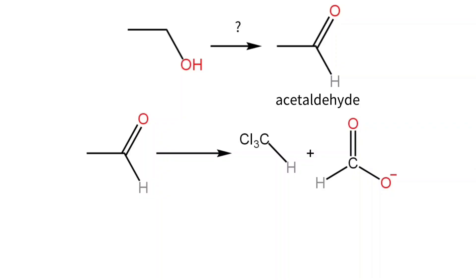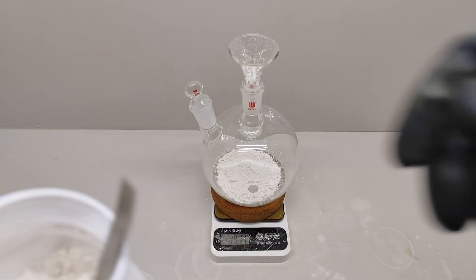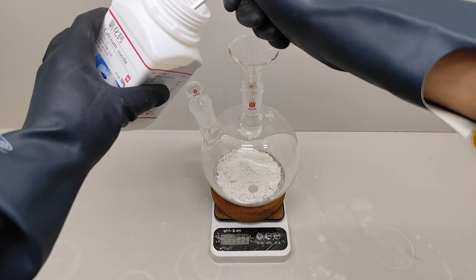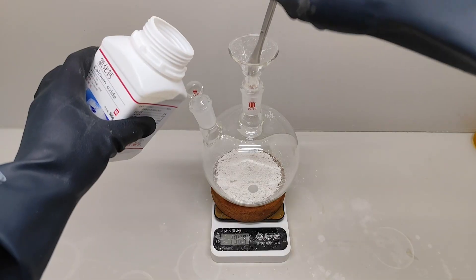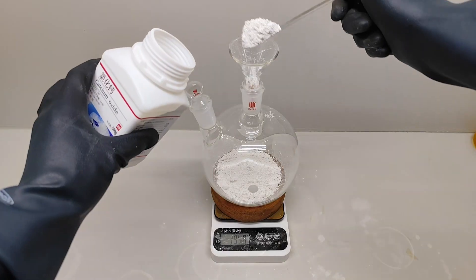The next problem is how to turn ethanol into acetaldehyde. The cheapest and easiest way is to dehydrogenate ethanol with a copper catalyst. To begin, I have to prepare some anhydrous alcohol, because the water in 95% ethanol would react with the copper catalyst and make it unusable.